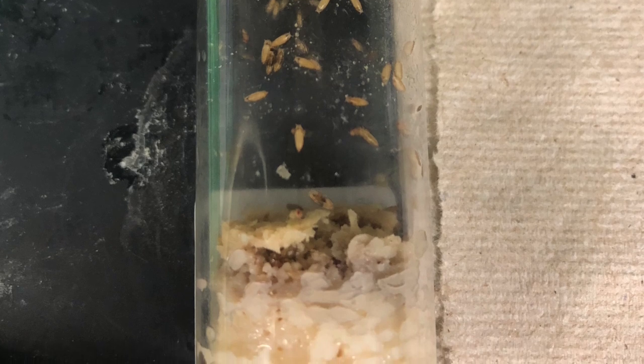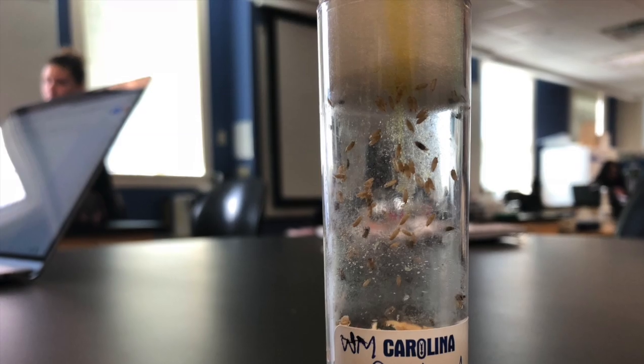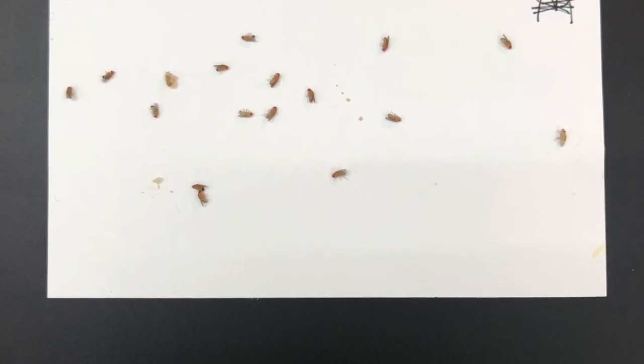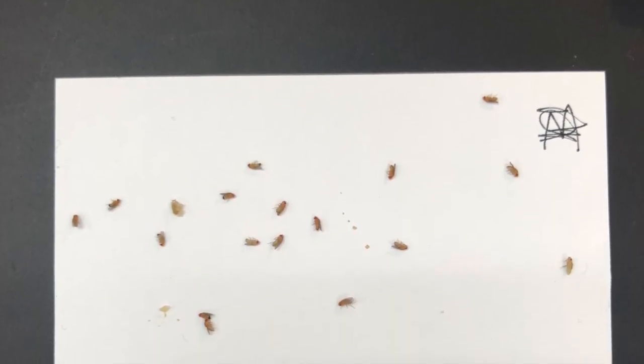To extract the flies from the test tube, it was gently tapped on the outside to loosen the asleep flies from their places. A small paintbrush was used to guide the flies onto the index cards.